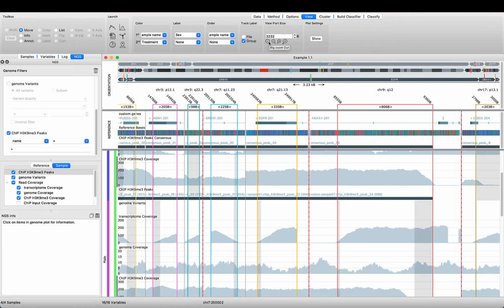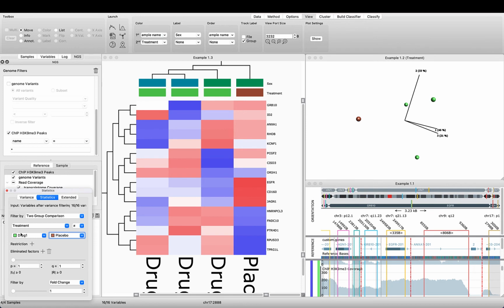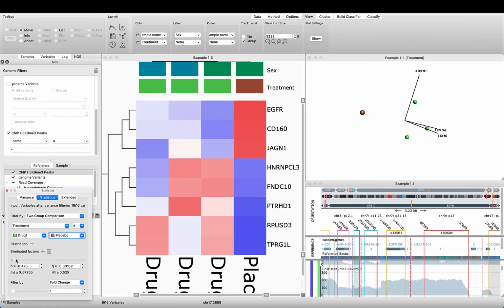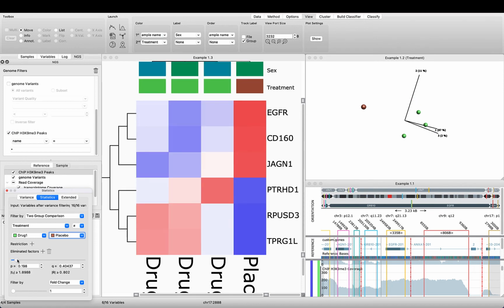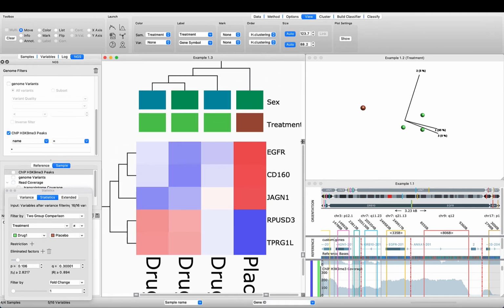Additionally, matrices for RNA sequencing counts, as well as detected peaks, can be generated using a GTF file for a comprehensive analysis, and you can quickly swap between the genomic space and expression-based analysis and use the broad suite of easy-to-use statistics available in Qlucore.